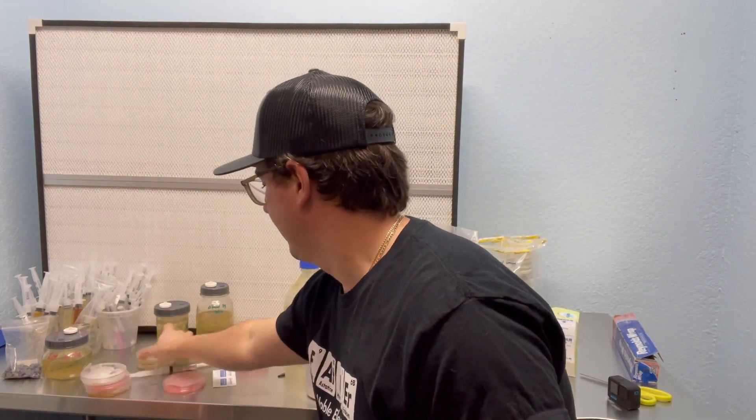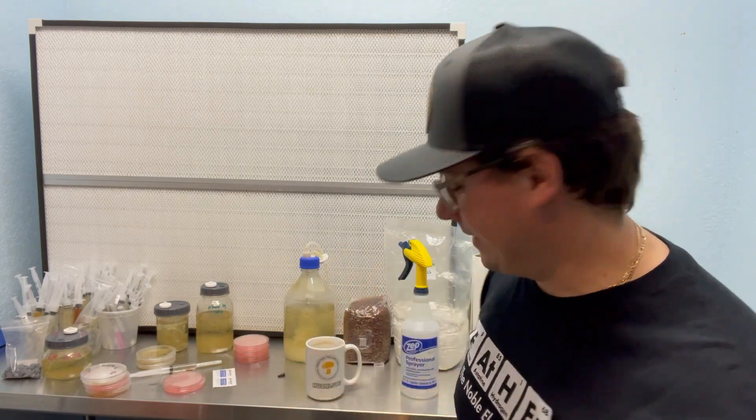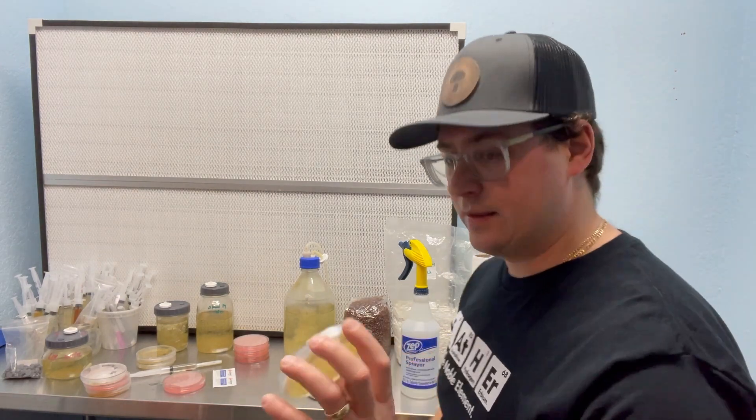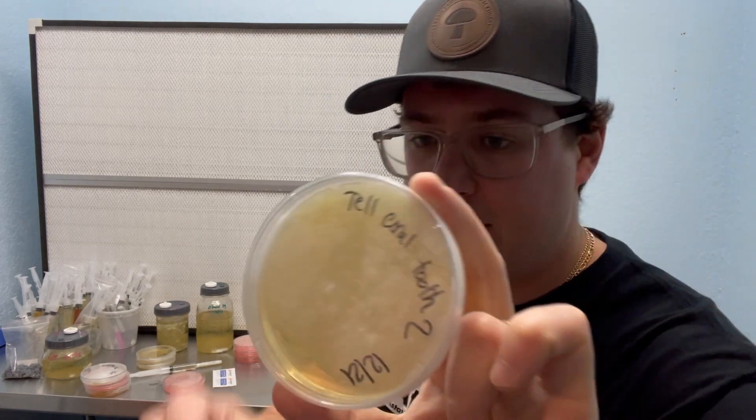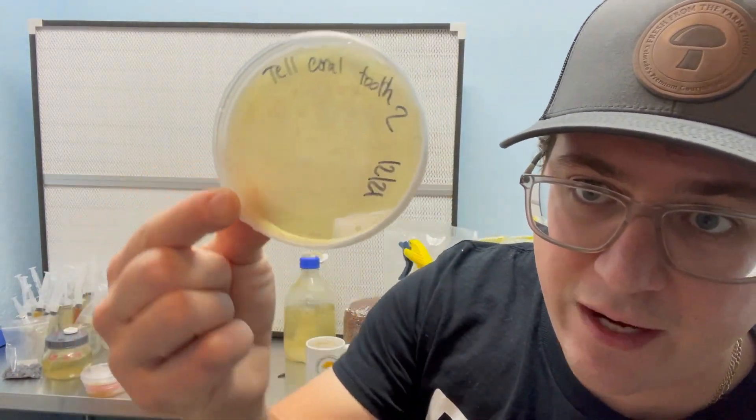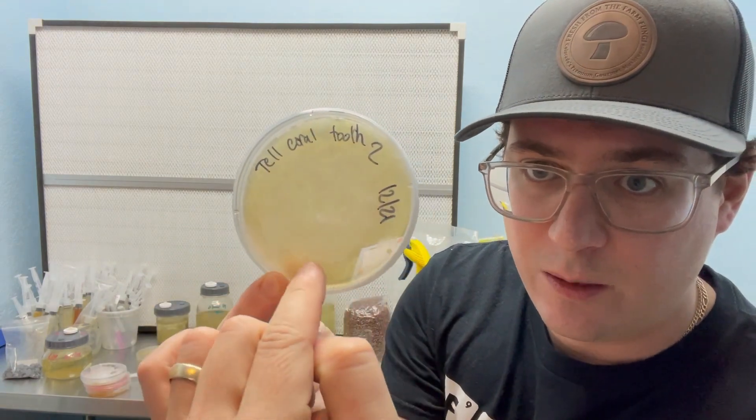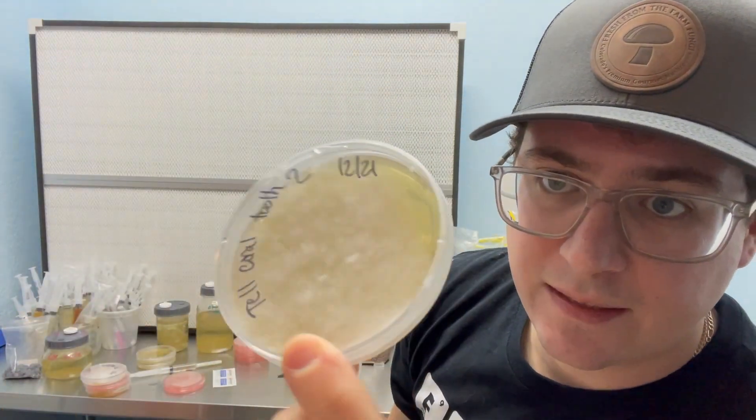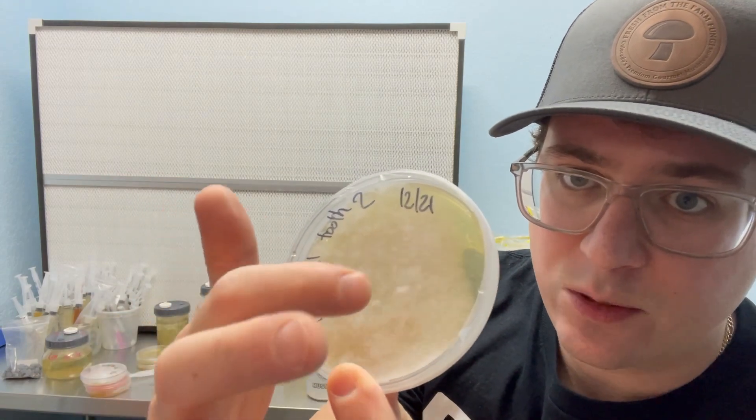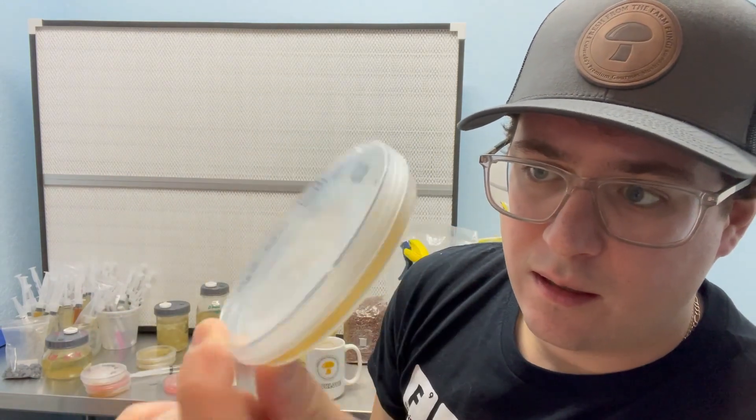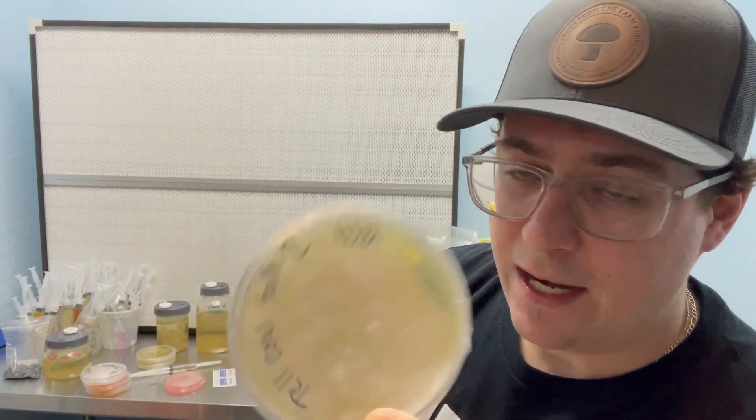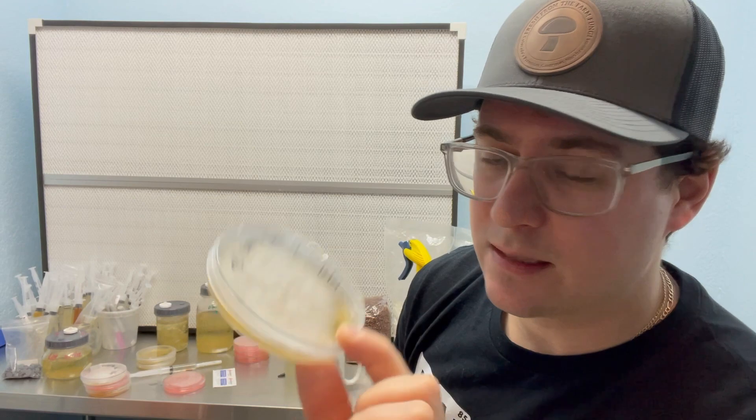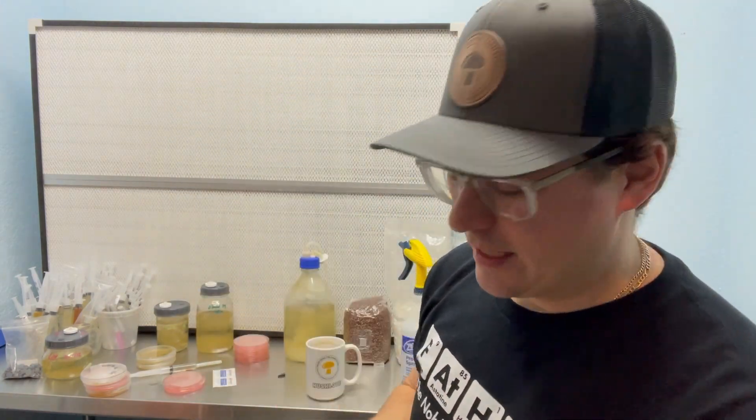So ideally you will just have a clean petri dish with white mycelium. I have a bunch in this incubator that I could show you guys. So this is a telluride coral tooth that was a sterile liquid culture verified on agar. You notice that there's a little bit of gap here, so I know that there's nothing growing behind it and it's nice and white and fluffy and it's starting to form these nodules, which is an indication of a hericium species most likely. But I know for a fact that it's a coral tooth mushroom because I found it in Telluride and I'll be releasing some liquid cultures very soon with the Telluride coral tooth.